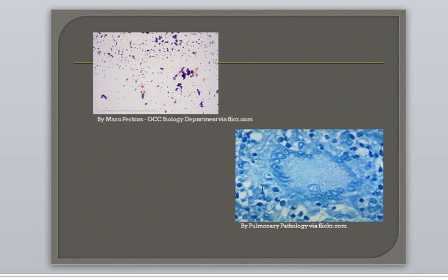Here are examples of differential stains. The first slide demonstrates a gram stain. On the slide are two species of bacteria: one which is gram positive and stains dark purple, and the other a gram negative, which stained pink. In the second image, a giant cell within the lungs contains numerous acid-fast bacteria. You can see the bacterial cells as they are stained pink against the blue stain of the lung tissue.